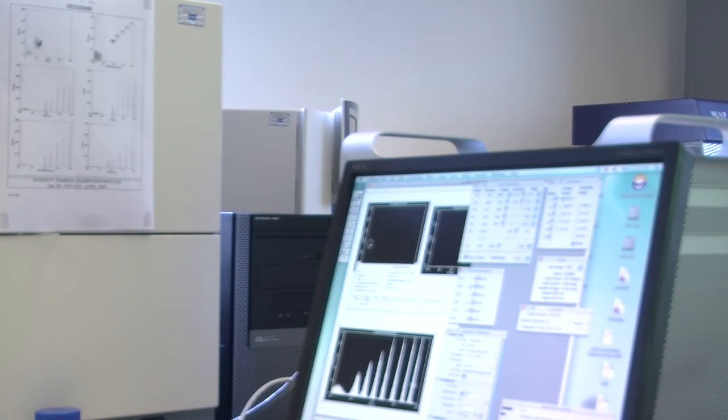Because what we don't want is the fluid with our cells in having lots of free antibody floating in it. When the laser hits that cell, there'll be antibody around it, so you'll get a higher result. Sometimes in diagnostics, you do what's called a no-wash procedure, where you just add antibodies and can't spin down. But as a rule, you're much better off spinning each time.